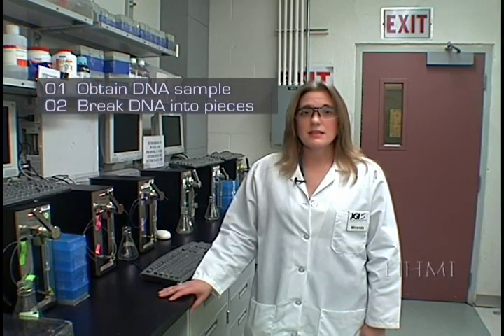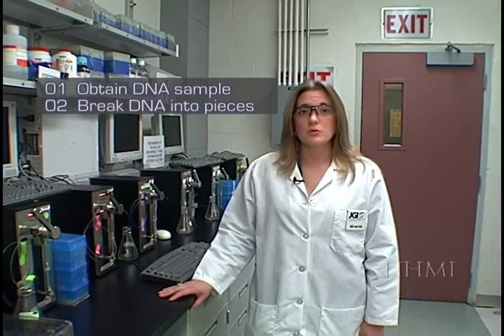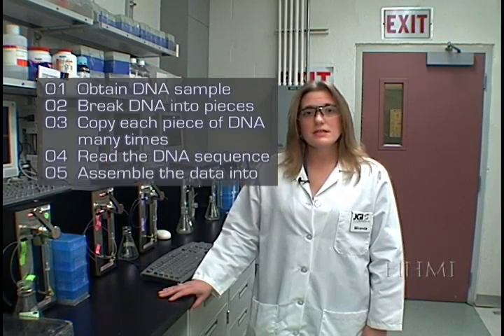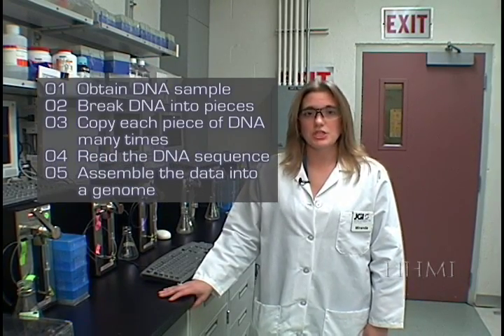Let's quickly review the DNA sequencing process. First, collect the DNA, break the DNA down into smaller, more manageable pieces, make many copies of those smaller pieces, read the pieces, and then reassemble the pieces into the larger genome.